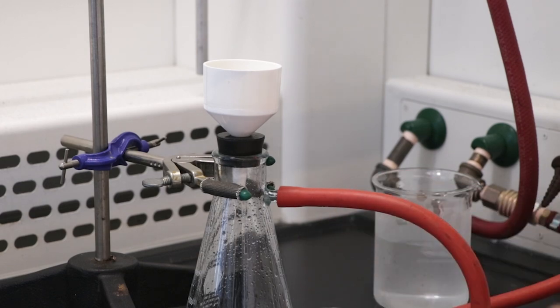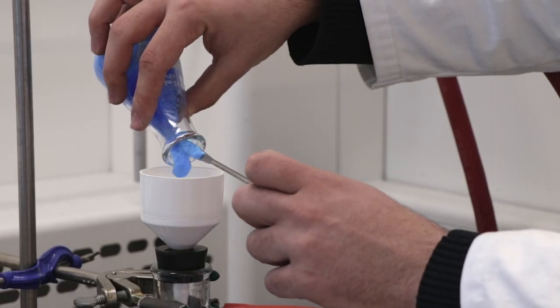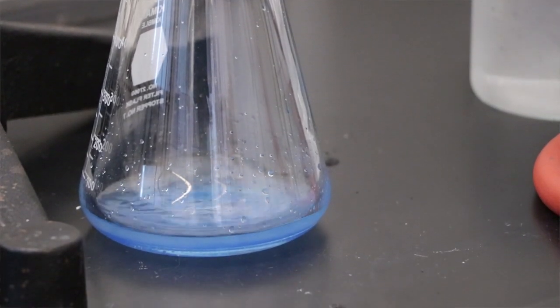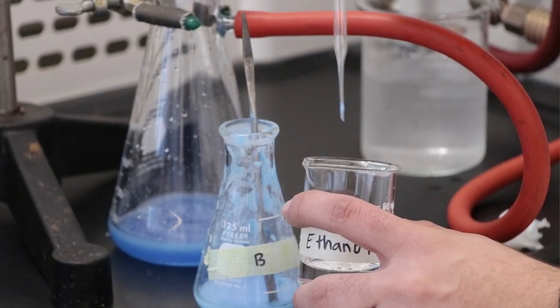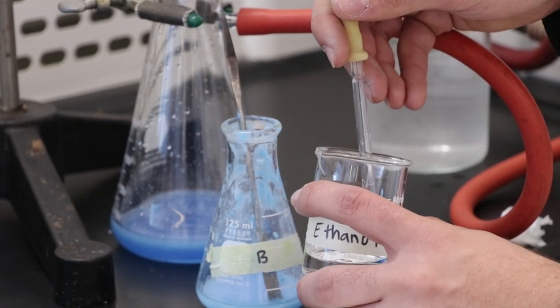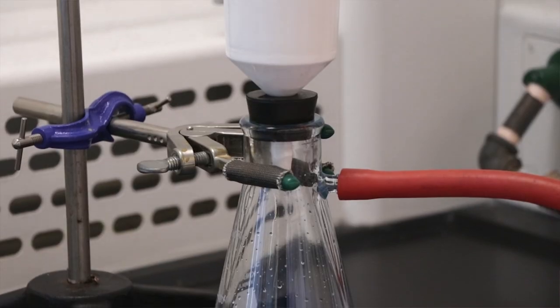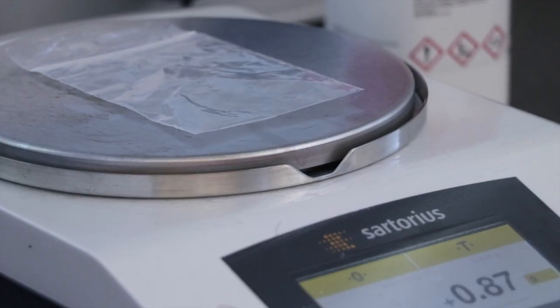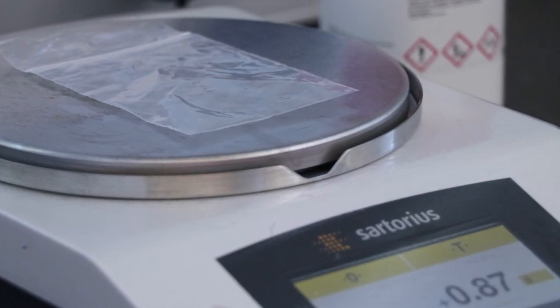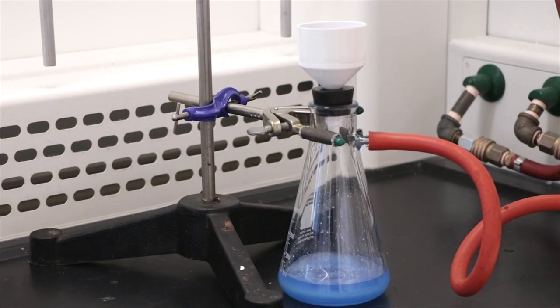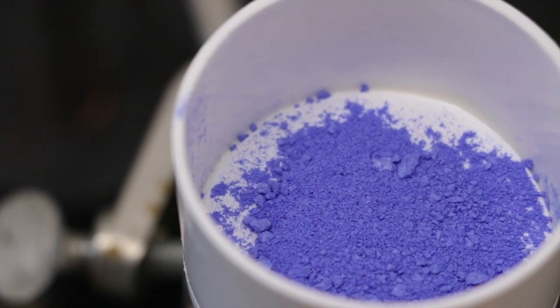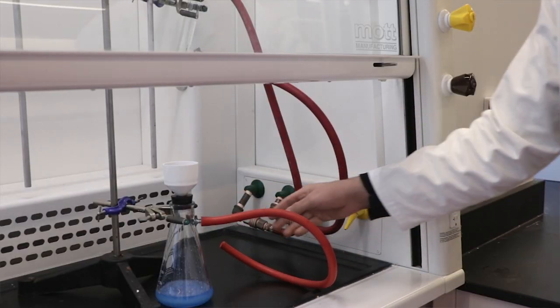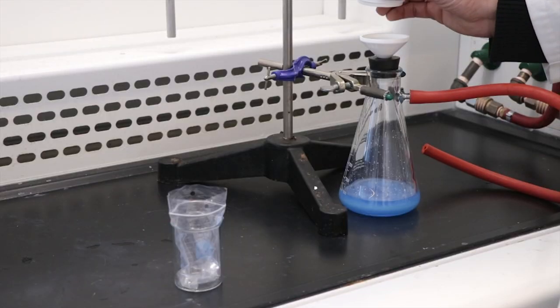Using a spatula, transfer the product into the funnel. Use a few mLs of cold ethanol to rinse out all the precipitate from the Erlenmeyer flask into the Buchner funnel. Allow the product to dry thoroughly. In the meantime, pre-weigh a plastic bag and record the weight in your lab notebook. Once the product is completely dry, detach the tubing from the yellow outlet before turning off the vacuum.